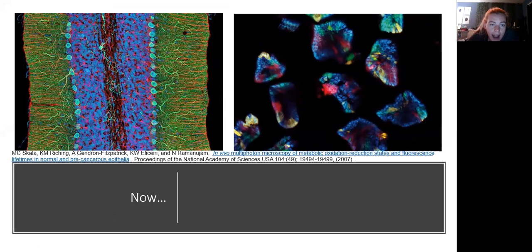And now it is so detailed, it almost looks like it's fake. They have a great spatial variability, and you can see the differences between the cell arrangements, and so you can tell what their cell functions are.